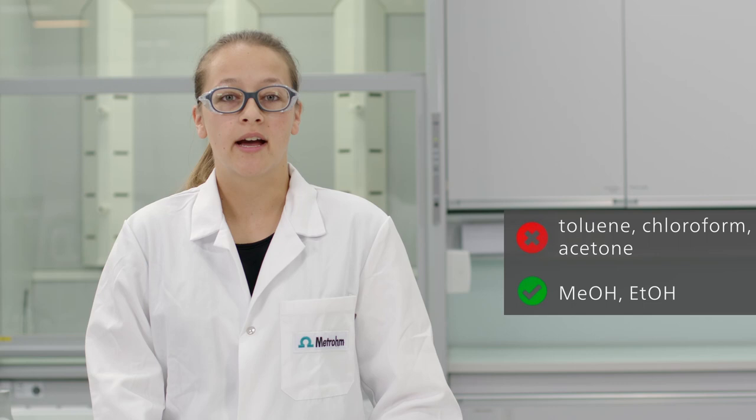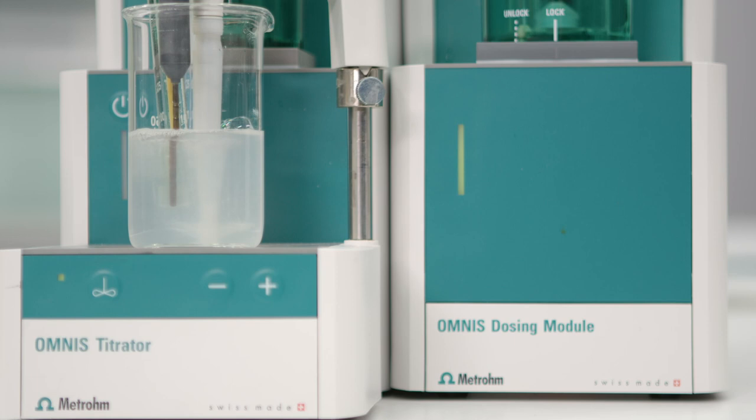Besides the surfactant electrode, you also need a reference electrode. We recommend the LL-ISE reference electrode. Now let's talk about conditioning of the electrodes. All three surfactant electrodes need to be conditioned before you can titrate the sample. To condition the electrodes, we recommend you carry out two to three titrations before your actual sample titration.